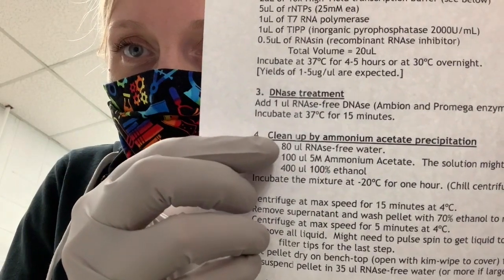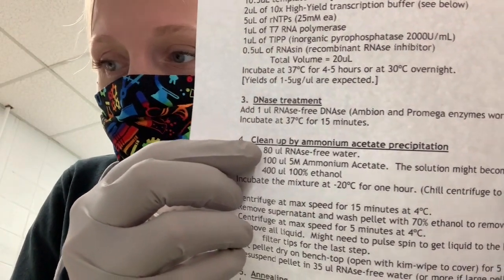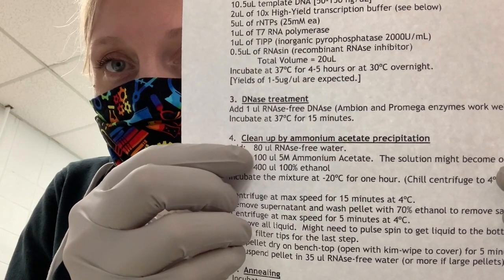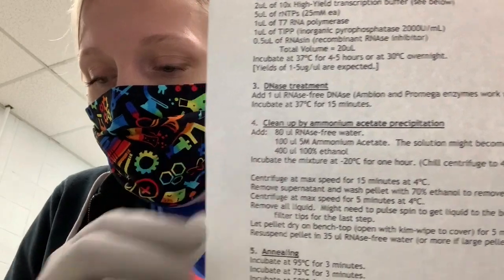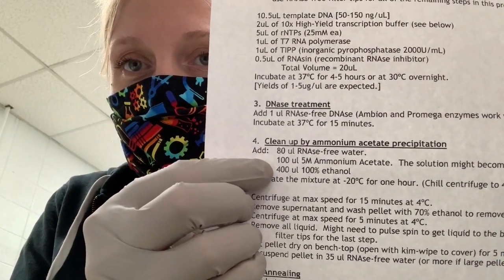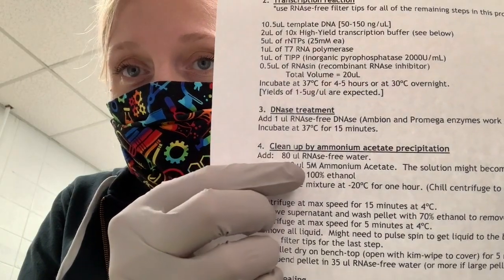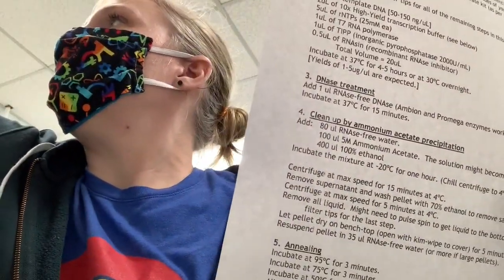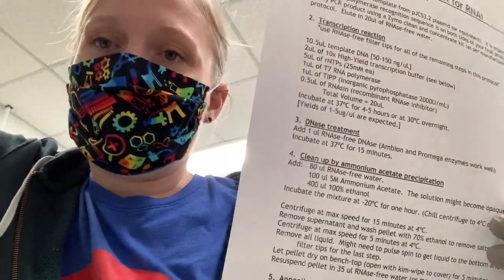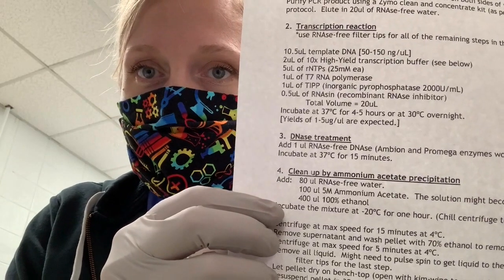So the first thing we're going to do, as this protocol says, is add 80 microliters of RNase-free water. I'm going to add 100 microliters of 5 molar ammonium acetate. And if you look at the samples when you add that, it might become opaque. And then you're going to add 400 microliters of 100% ethanol. We have some 200 proof ethanol that we use for molecular biology experiments. So I'm going to add these things to each tube.